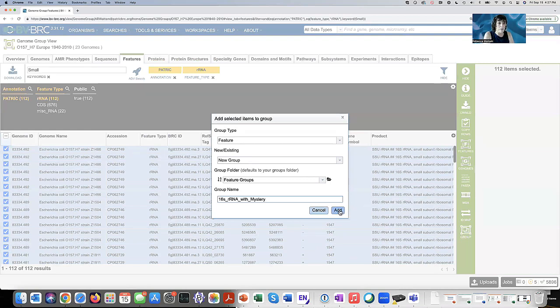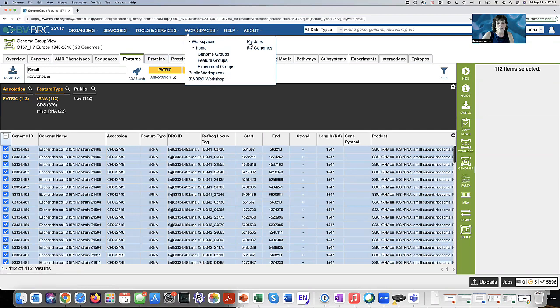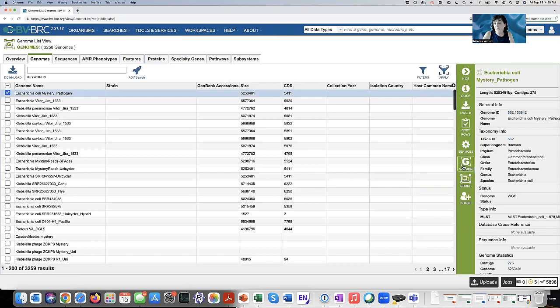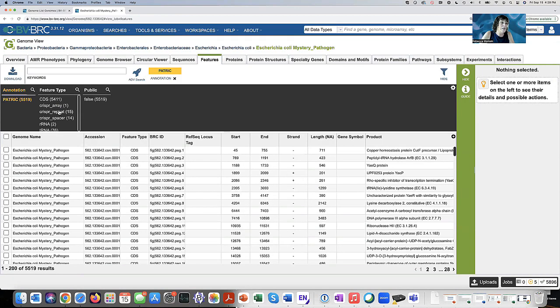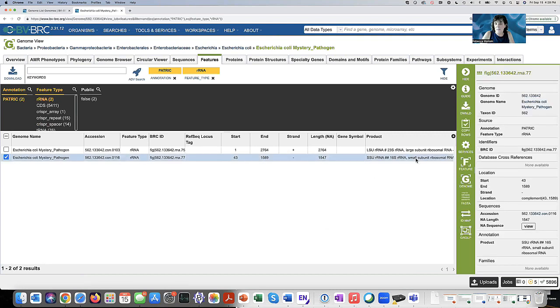So this is one group, but you're going to say, hey, wait. This is just this O157. The mystery one isn't here. Just wait, I'll show you. Let me learn you how to do it. So I'm going to add that, and it has created that group. And then I go back into my workspace. I click on my genomes. I click on my mystery pathogen. I go to genome. I go to features. I click the filter. I go to ribosomal RNA, and there he is right there, my 16S.